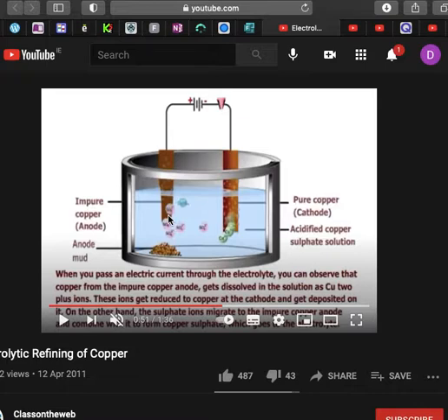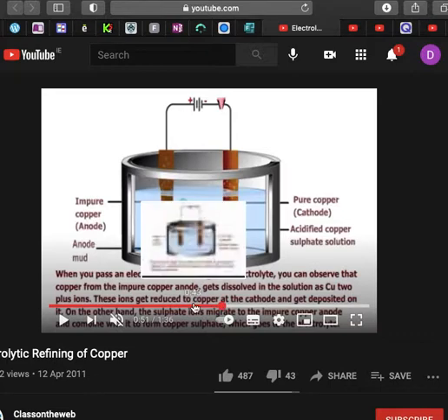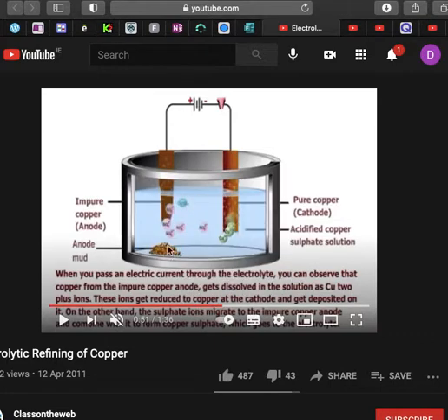There are bubbles of gas. Not necessarily. These aren't bubbles, these are supposed to be the ions in solution. Give me something else. A bit of the anode that has dissolved is sitting at the bottom. Absolutely. This is called sludge. So the anode has gotten smaller, definitely.